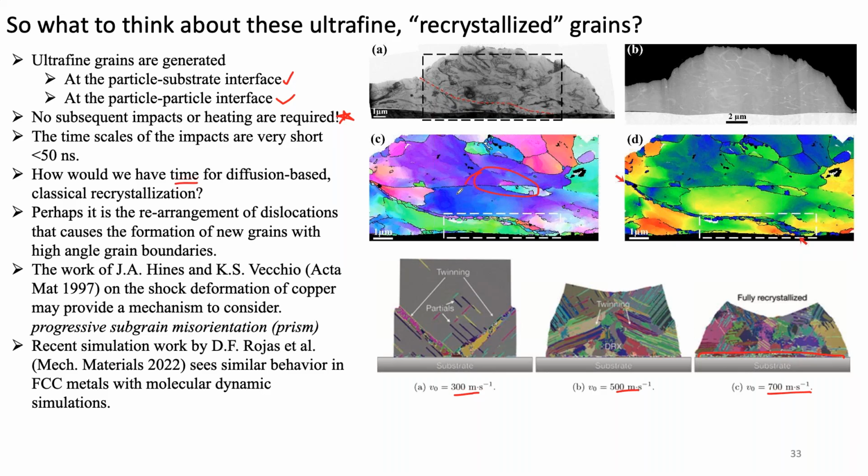A follow-up comment about the polishing. Someone has piped in that multi-beam ion polishing works well for those cross sections, for big areas. When they say multi-beam, do you think they mean broad beam? I don't quite know what they mean by multi-beam. I think they mean the broad beam. Okay, yeah, that's good to know, because I think that's a great idea.